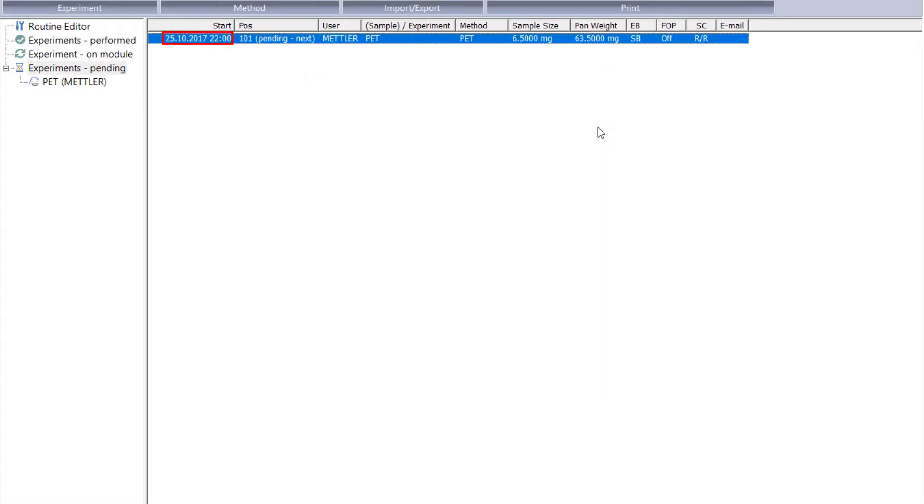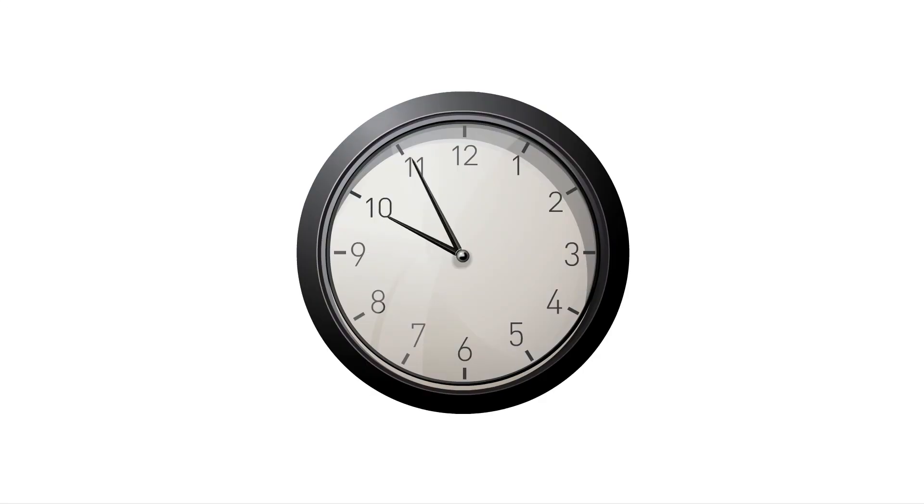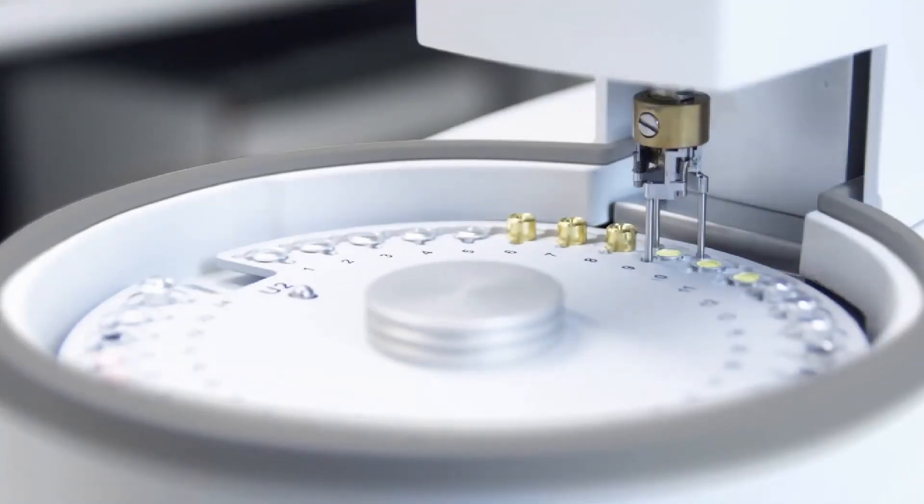The start date and time is then displayed on the experiment buffer in the START column. Confirm and save your settings by clicking OK. Now you have scheduled the start date and time for your chosen experiment.